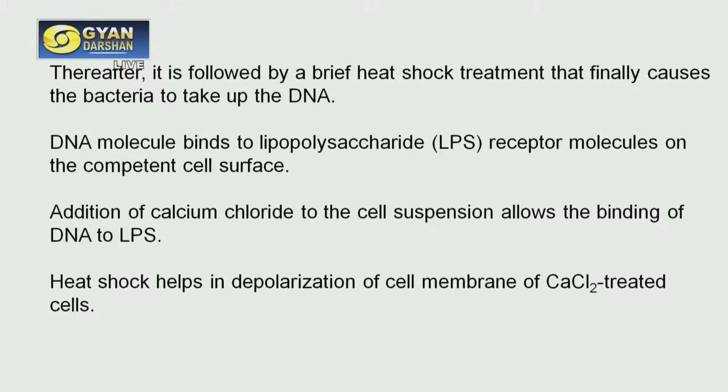Because if you are doing the experiment with E. coli, which is the common model used, then E. coli is a gram-negative bacteria and it has the lipopolysaccharide molecule. So the DNA molecule binds to such lipopolysaccharide, and the addition of calcium chloride to the cell suspension allows binding of the DNA to the lipopolysaccharide.